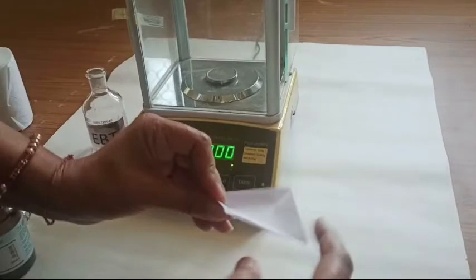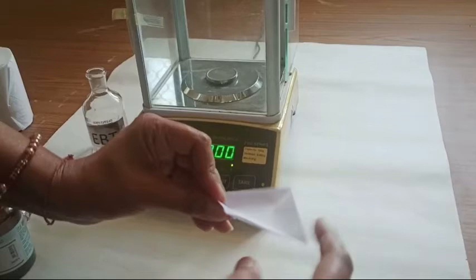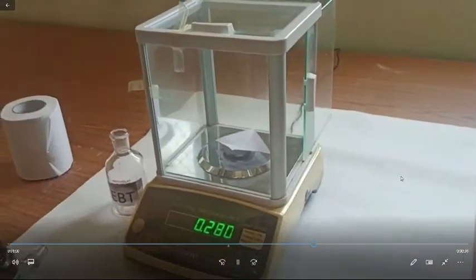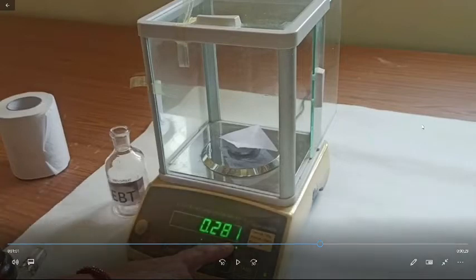This is the paper in the square form and now we fold the corners so that it can hold the sample effectively. It would be better if you use butter paper instead of this white paper. Since I do not have it, I use simple white paper.